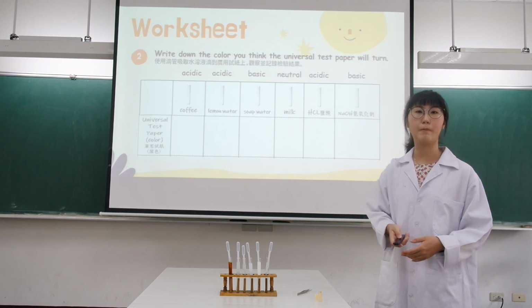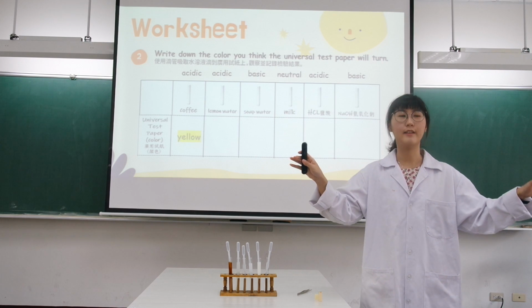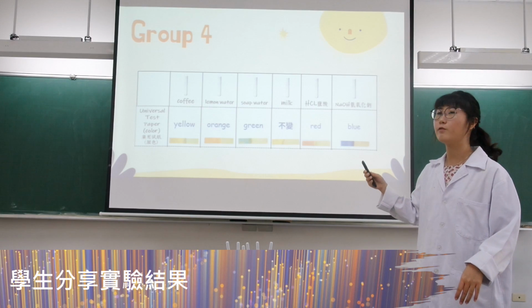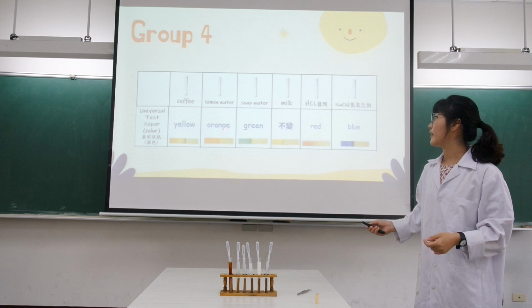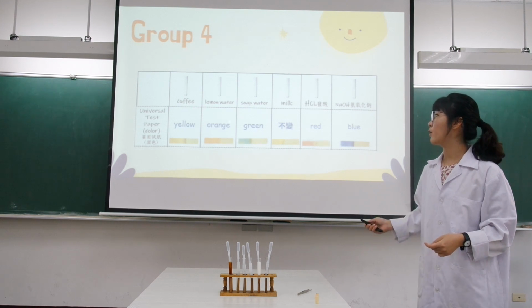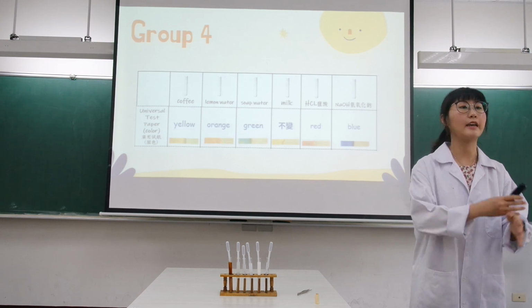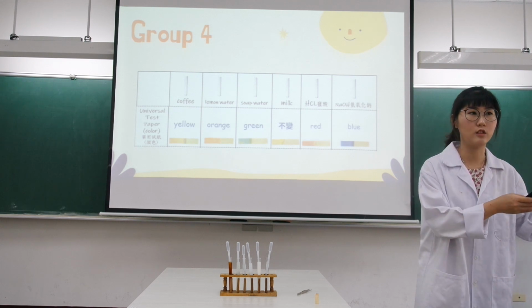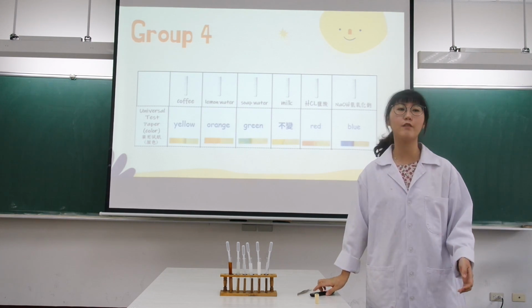Can you tell me if we use... orange? Very good. Thank you, Maria. Okay. And we have the universal test paper turn green. Okay. Maria, can you tell me if we use it to test lemon water? The universal test paper turns... Can you say it in a full sentence? The universal test paper turns orange. Very good. Thank you, Group 4. Let's give them a round of applause.